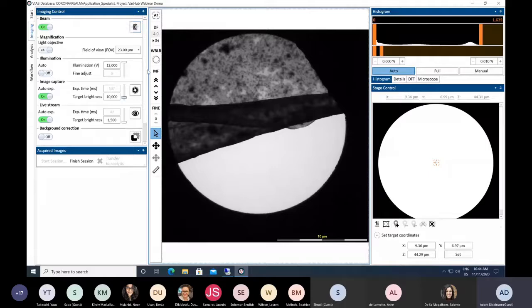You may be a little bit confused possibly why it says light objective, but the MiniTEM actually uses a combination of electron and light optics. We actually have a crystalline screen called a YAG screen that transmits the electrical signals into photons of light, which are then picked up by either a 4x or 20x objective, and then the image is formed on the camera, which is hopefully what you can see in the center of the image.